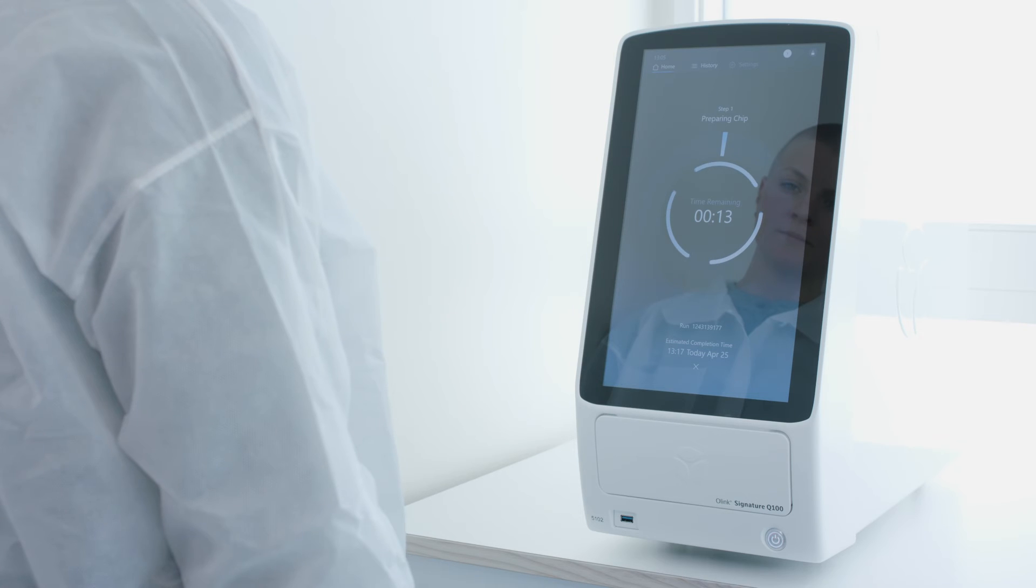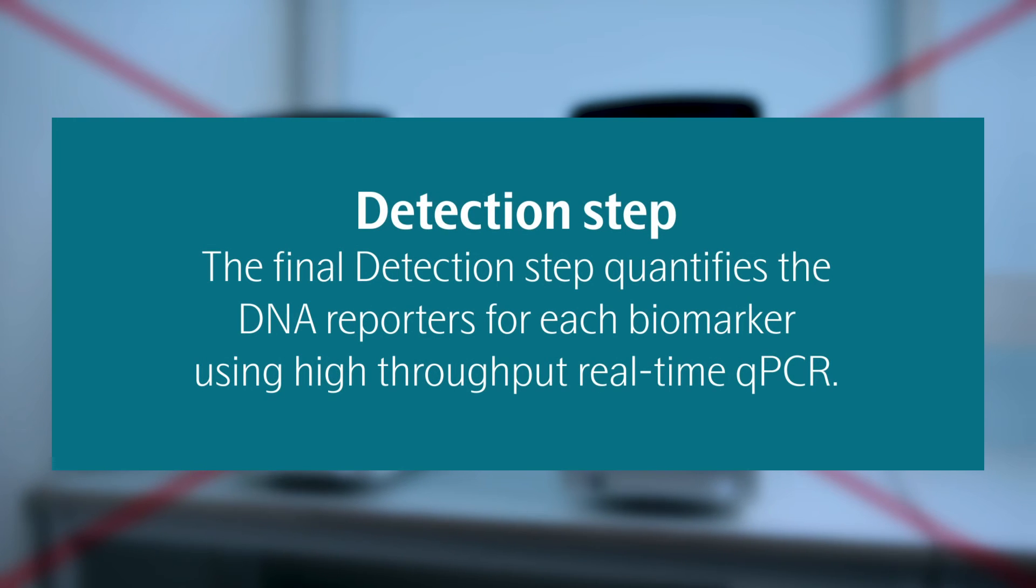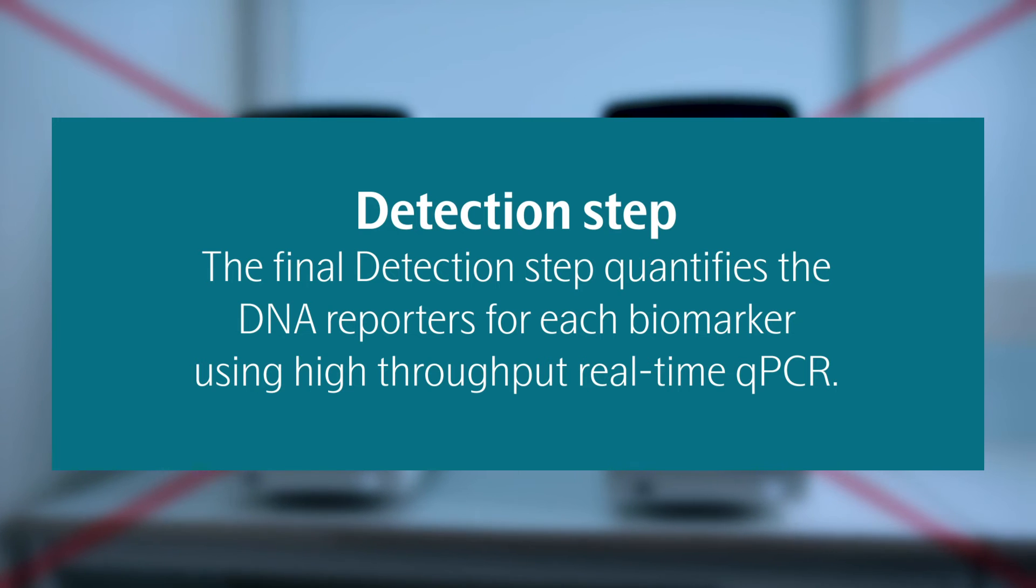Preparation begins and displays the preparing chip screen and the time remaining. During the priming of the IFC, prepare the detection mix using the following labware and reagents. The final detection step quantifies the DNA reporters for each biomarker using high-throughput real-time qPCR.